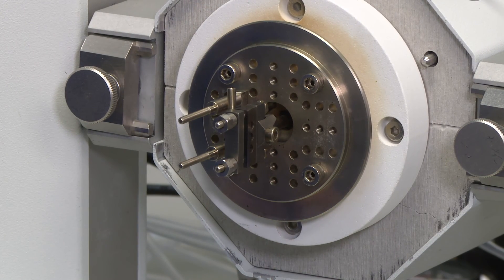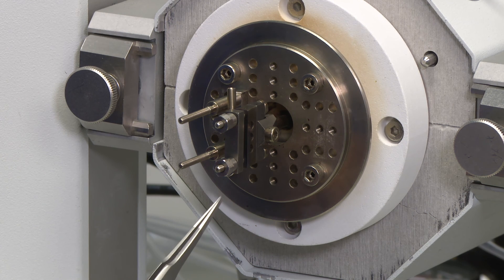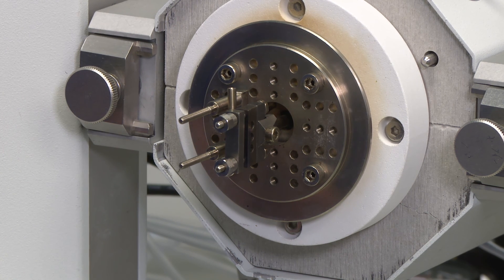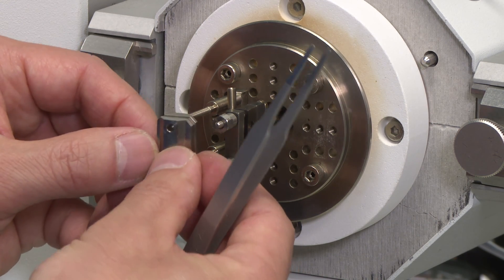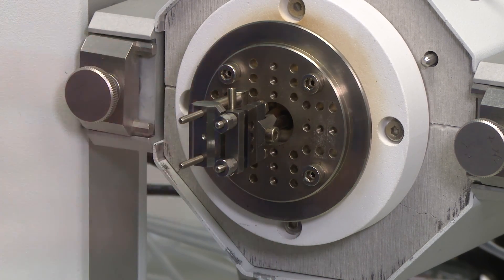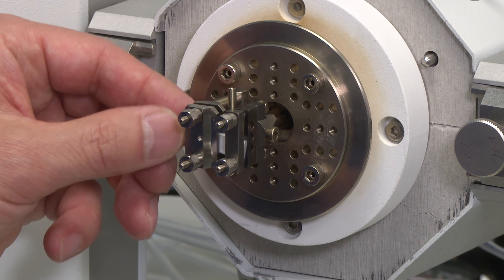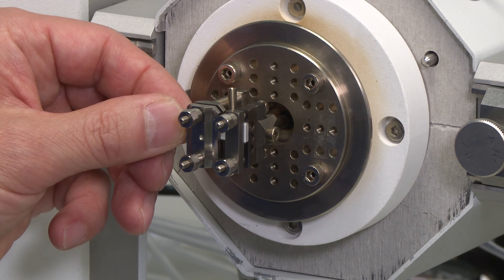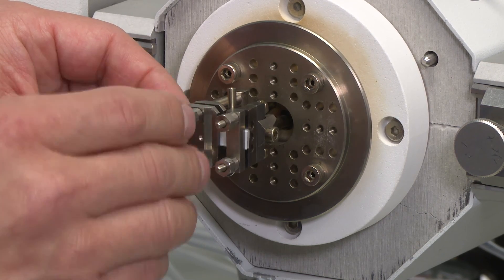For very short samples, you can move the fixed pillar closer to the drive shaft and also use these extenders to run very short samples. Now you can run very short samples with minimum length of 1mm free length.